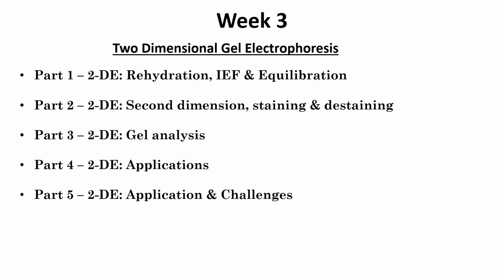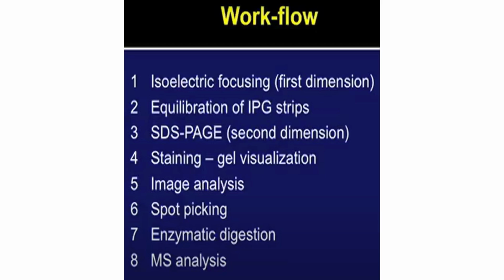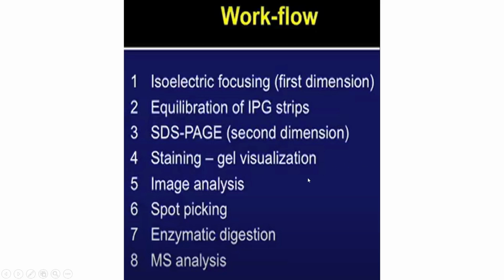So in week three, Sir majorly discussed the main techniques, two-dimensional electrophoresis and DIGE in the week four lecture. So how exactly does 2DE work? To do 2DE, this is the workflow.